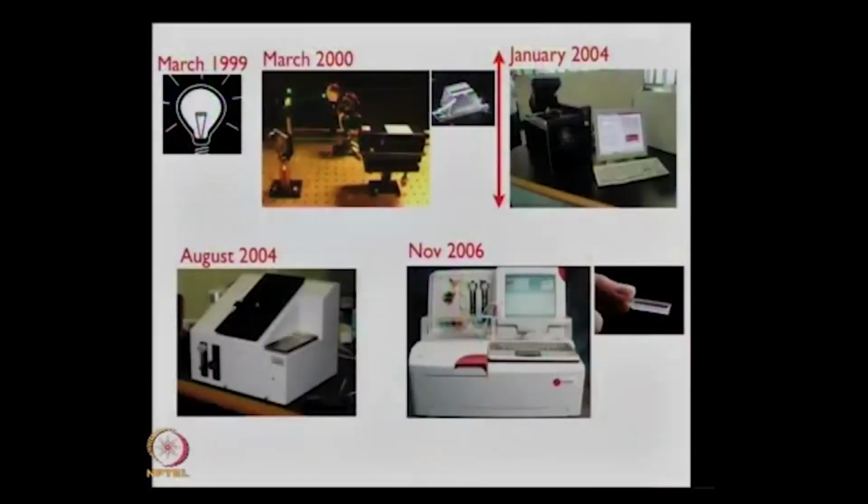And this is important, that thing that I believe in: for science to be able to benefit society, it has to be turned into a product that others can actually use. And so this is the path of the instrument. This is how it was in my lab, and up to now, we still have these instruments in my lab. We still work on the benchtop. But what we did is we translated it into a series of steps so that the current device that went out in the market late 2006, early 2007, is an instrument that other people can use.